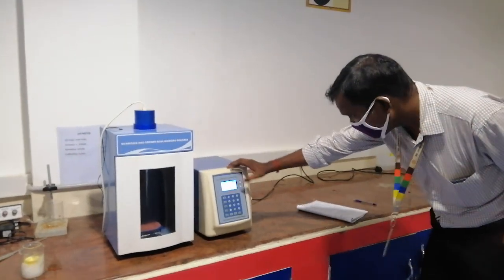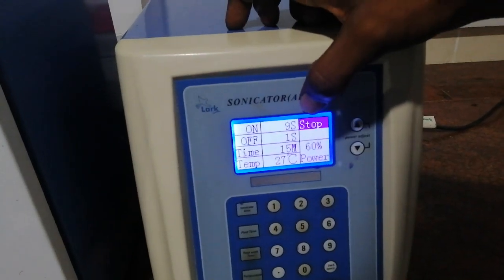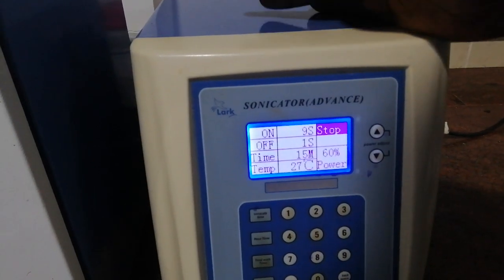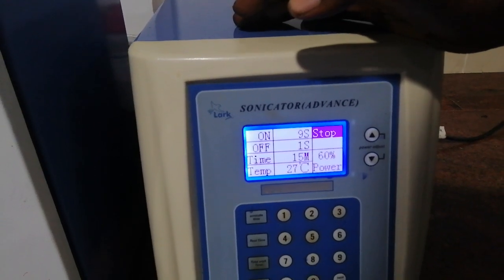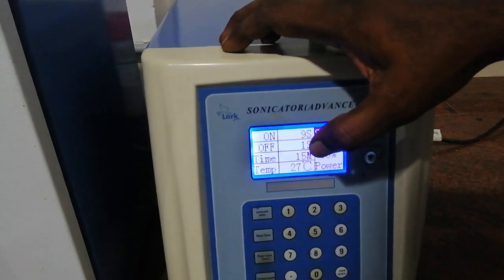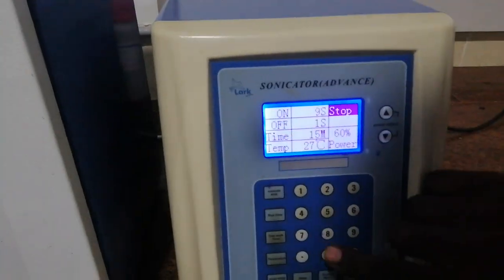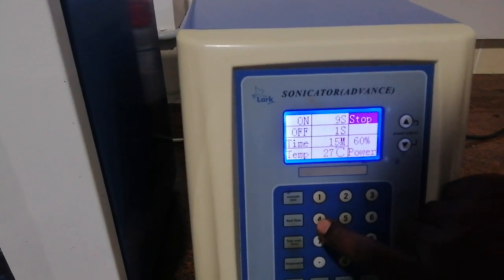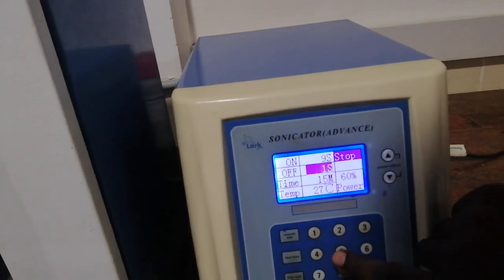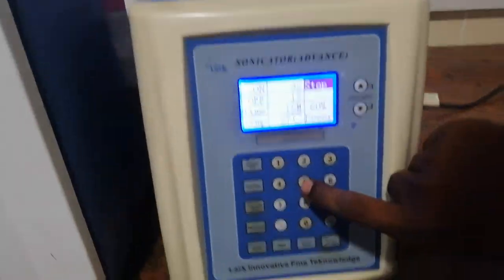So in this display, we have fixed the on time at 9 seconds and the off time at 1 second. So it will run for 9 seconds and then it will be off for 1 second. Therefore, the heat can be removed by a cooling system. The next one is the total time. Here the cycle time is 30 seconds, so we have to set the time. The working time is 0.5 minutes.